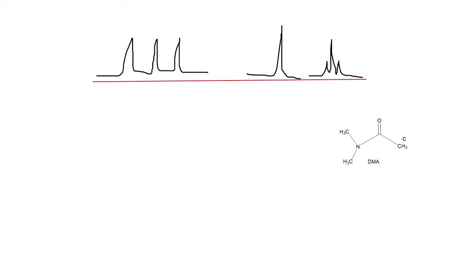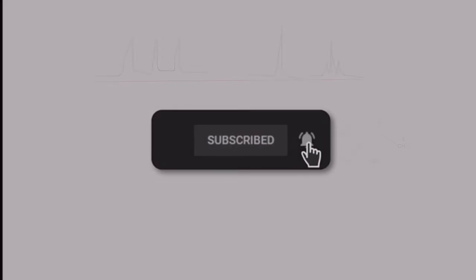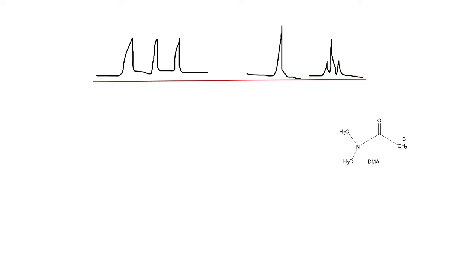Today I am making another video on NMR and how to calculate the concentration of a certain compound in terms of an internal standard. Before going to a real example, I tried to make some presentation here, just to see how we are going to do this calculation.